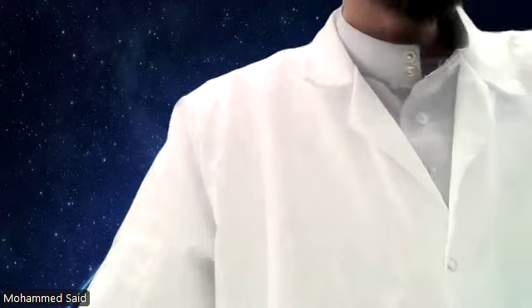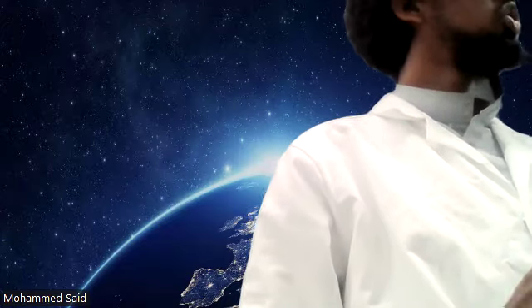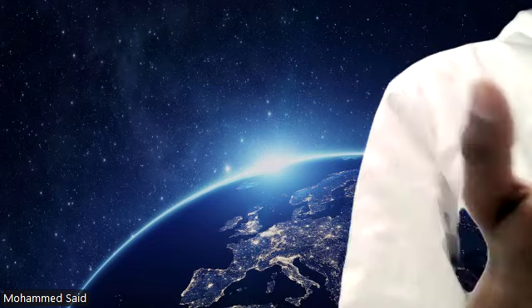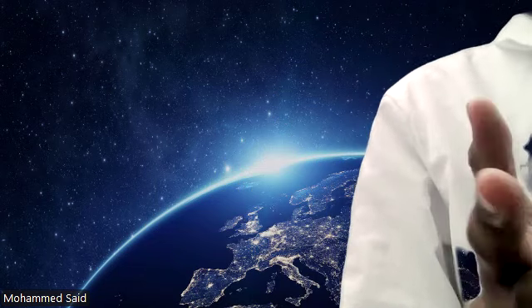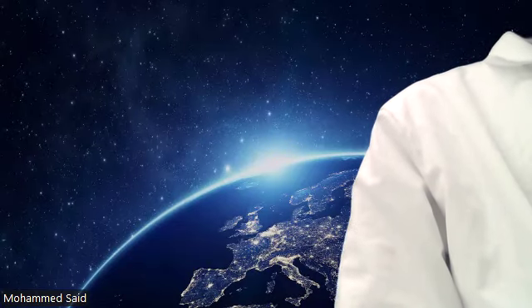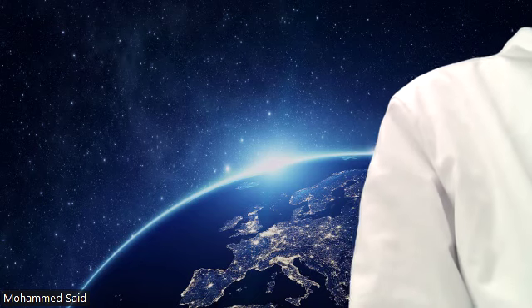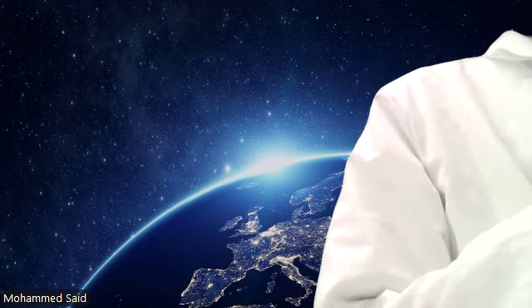So, that being said, we're now into the generation time assignment. I posted the material online for you, so you should have everything that you need. If your group is also done, you can clean up your benches with 70% ethanol. If you're done with your viable counts and your plaque assays, with your data, you can share it with me over email. But I just want to highlight for the generation time assignment, in your notebook, you could take notes of what I'm about to share in due time.